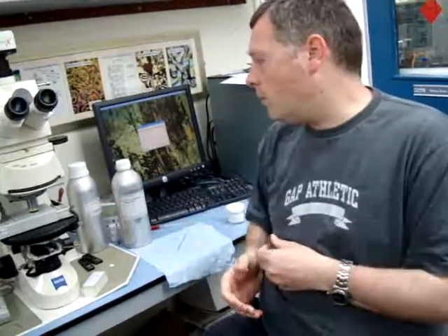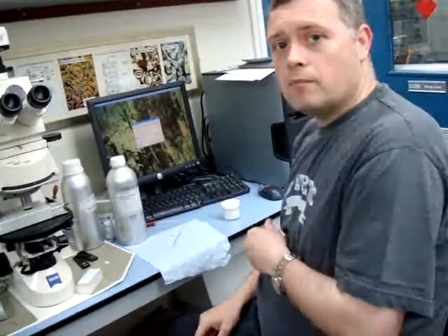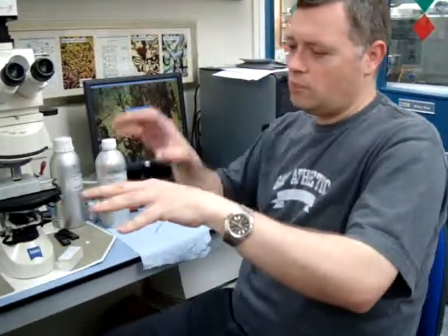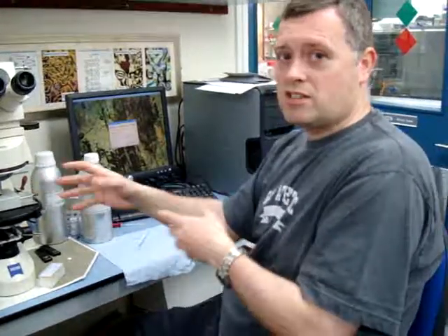were existing before. How does it compare to an organic compound that just melts and doesn't have any LC properties? Right. Okay, so for an organic material that just melts, it will melt and go into the isotropic liquid. So you'll just see the crystals melting over a range of temperature. Yeah. And then on the microscope, the isotropic liquid, because it's so randomly organised, doesn't interact with the light, so you just see optical extinction through the polarizers.